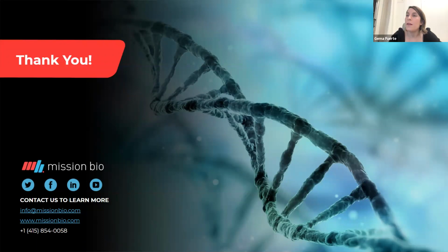Yeah. So fixed cells has not yet been tested, and intracellular protein staining is development work. So we have not tested these. Fixed cells has been tested and validated for DNA only, not yet for DNA plus protein. And we are working on the intracellular protein staining, but we don't know when this will be ready. Great, thank you.